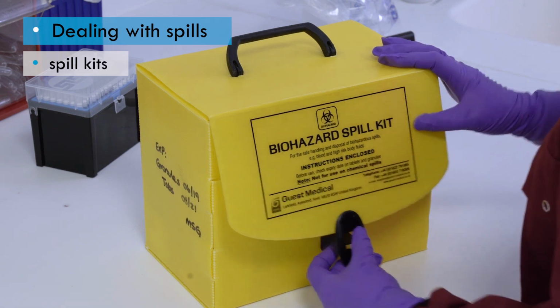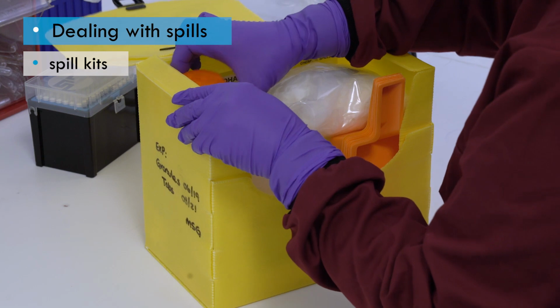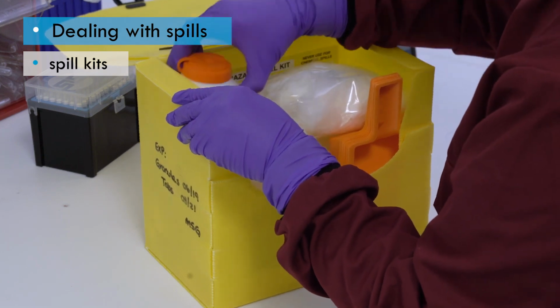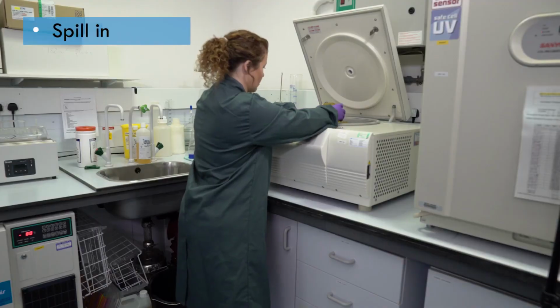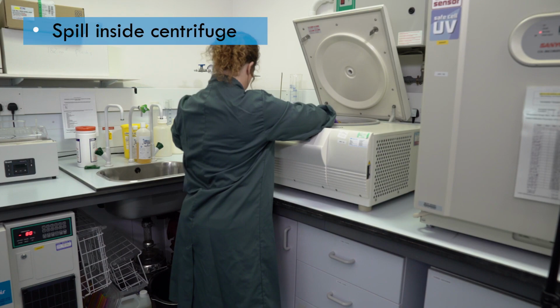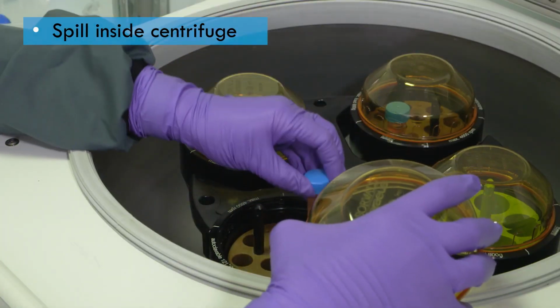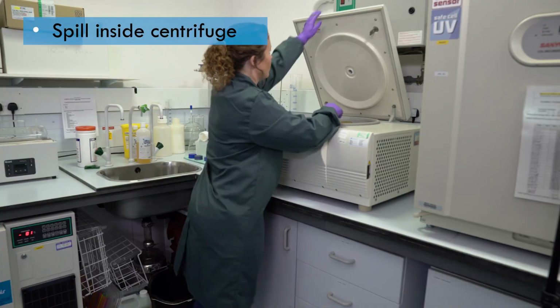Some laboratories are equipped with spill kits. These contain all the disinfectants and absorbent materials that are needed for dealing with a spill. On rare occasions, spills may occur within equipment. For example, a tube might break inside a centrifuge during a cycle.